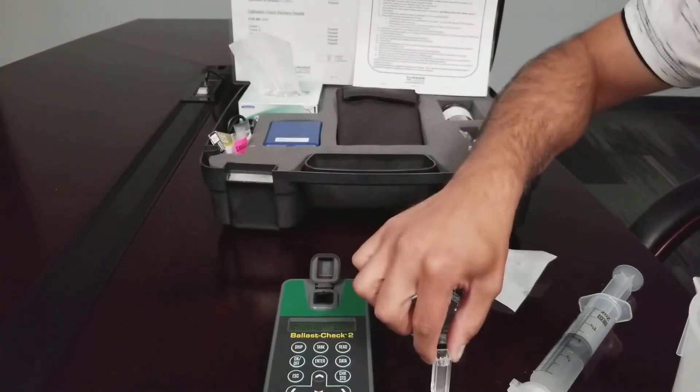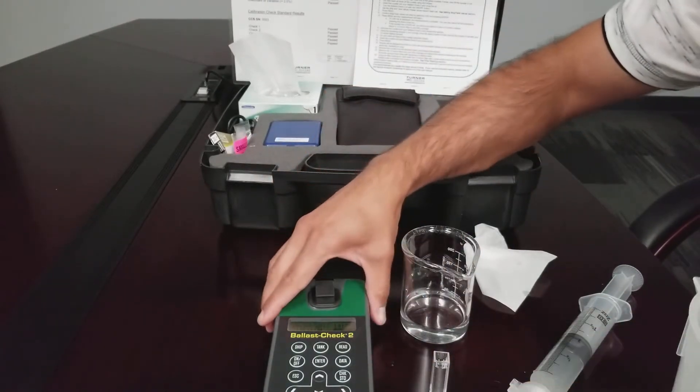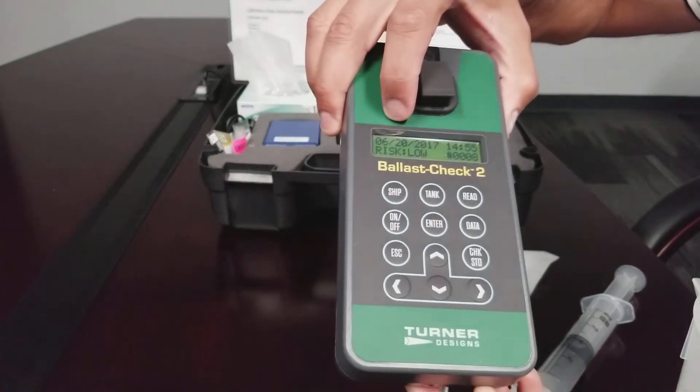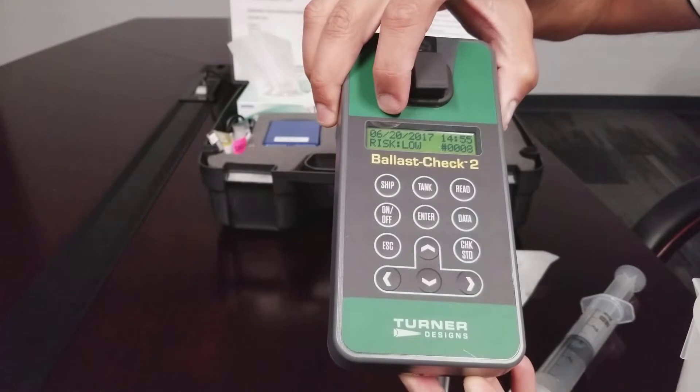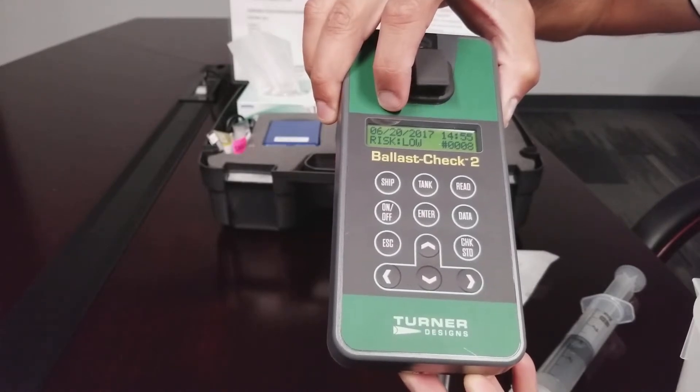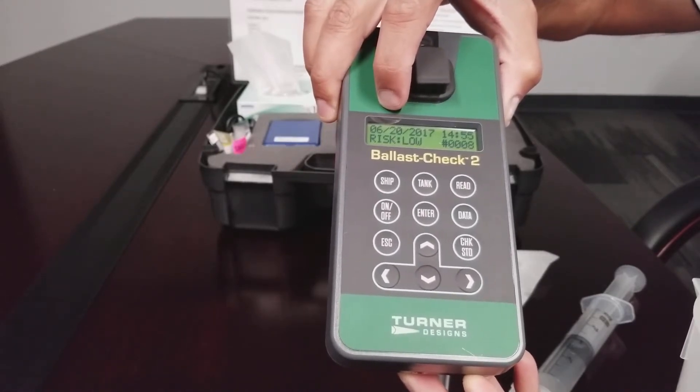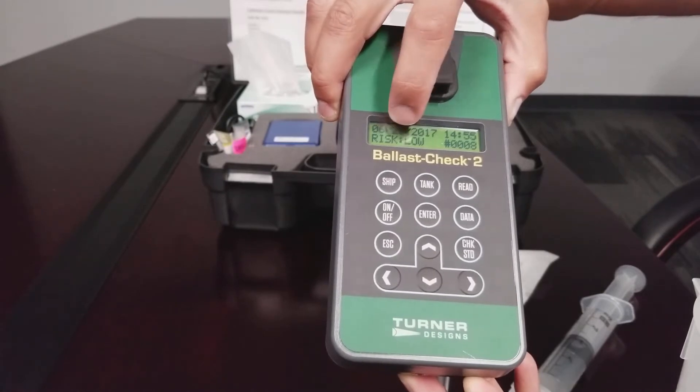Remove the cuvette from the sample compartment. Results will be displayed on the screen and logged to memory to be downloaded at a later time. Risk and indication of exceeding the discharge standards is displayed on the screen as low or high. In this case, risk is low.